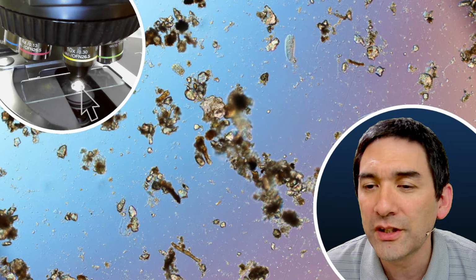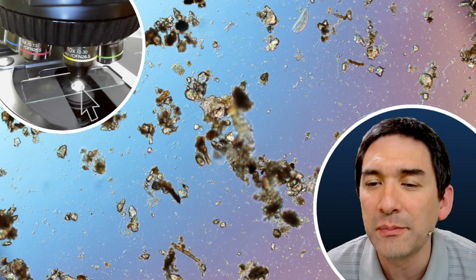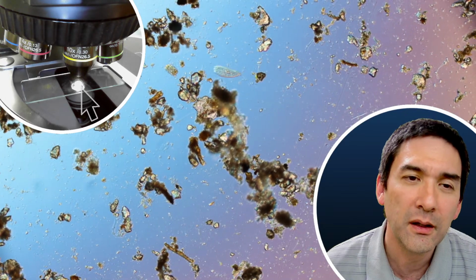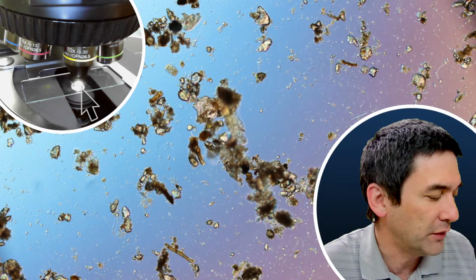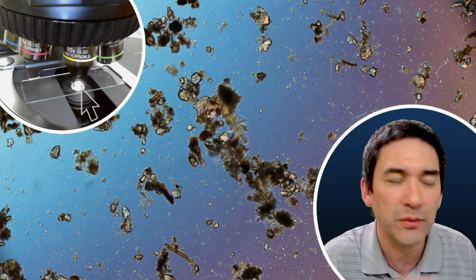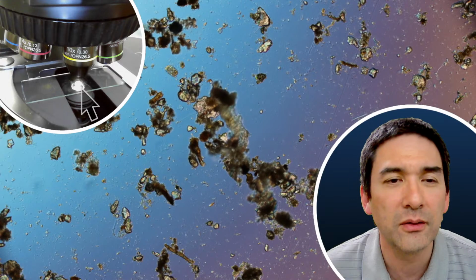Fun fact, just as rotifers, they have eutely, yes, which means that the individuals inside some species have exactly the same number of cells. Somebody actually sent me a link to that. Somebody actually found out that the cell number is the same. Apparently, he did some staining techniques and he was able to somehow count the cells this way. So that is quite interesting.